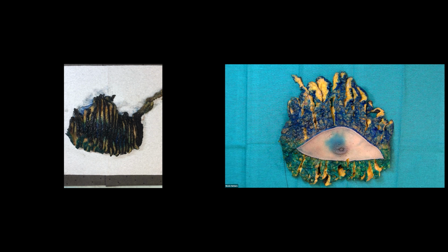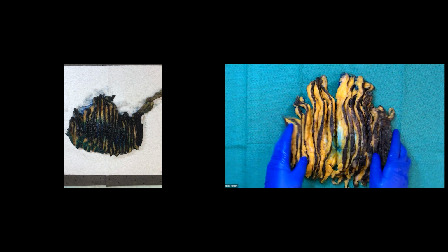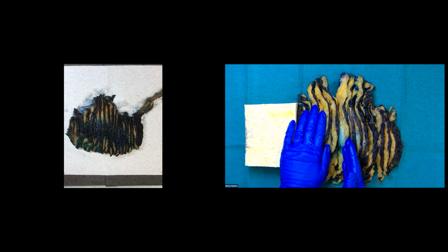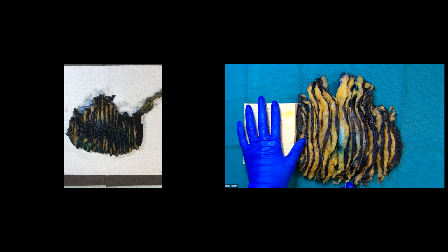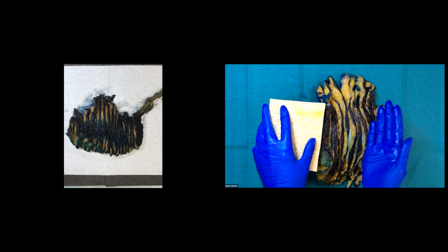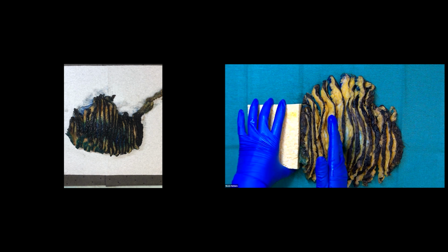Another thing is sometimes you get these really floppy breasts where it can be really difficult to make nice even cuts. So I will actually use a sponge to help prop up the specimen a bit, like this here, just to hold it more in place when I'm cutting, so the tissue doesn't all just fall apart. It's important though, if you're using the sponge or even your hand to hold here, that you're not pushing the specimen over at all like this, because then your cuts will become more on an oblique angle versus actually straight up and down.